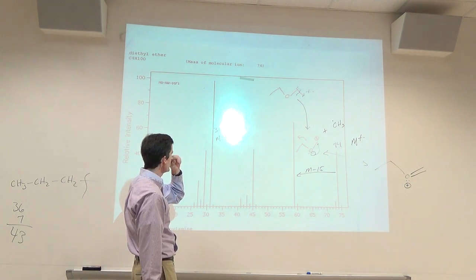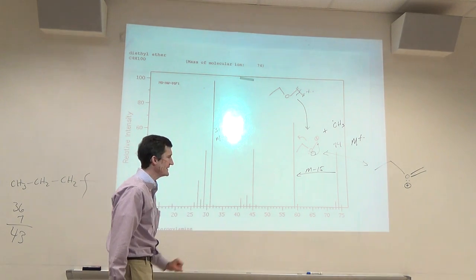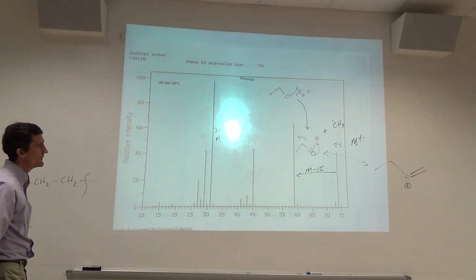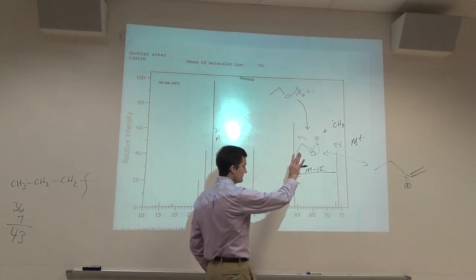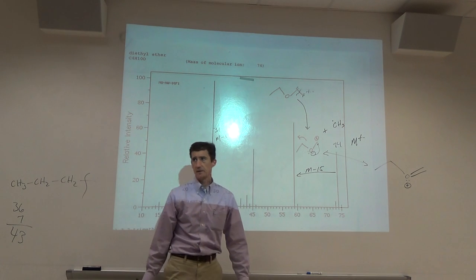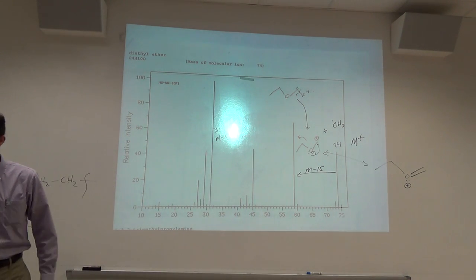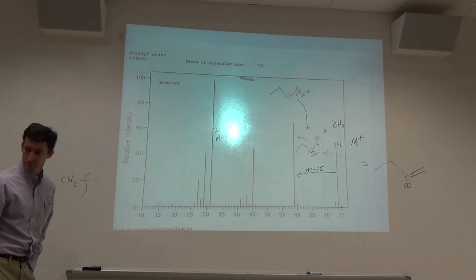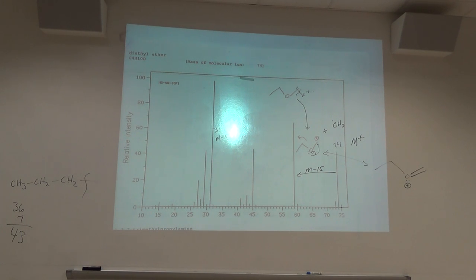Let's not look at anything else here because the base peak is really not that. I don't know what the structure of the base peak is. This is your very predictable cleavage. What is this right here at 75? There's a little peak there. What is that?